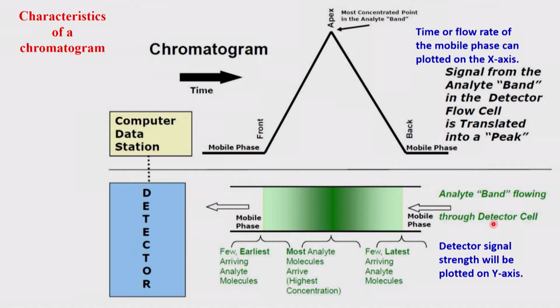Now, another way of looking at it: you take this as your column and this is your material that you have. You are pushing your mixture from here along with the mobile phase, it will go here, and you see a lighter region, that means only solvent or background. As you keep going across towards the left side you see darker and darker, and greatest dark exactly at the peak point. So, this darkness is increasing on this side and decreasing on this side. When you come from this side it increases, when you go to this side it decreases. So, again it became lighter, you can see that.